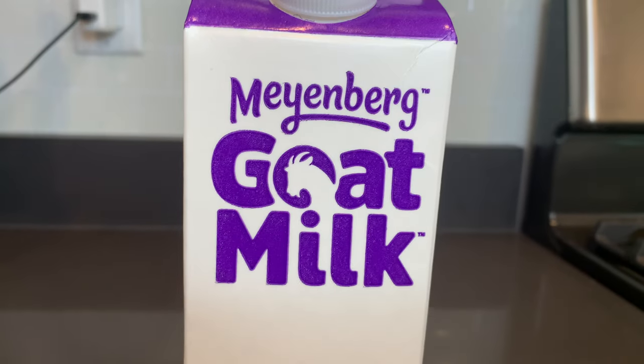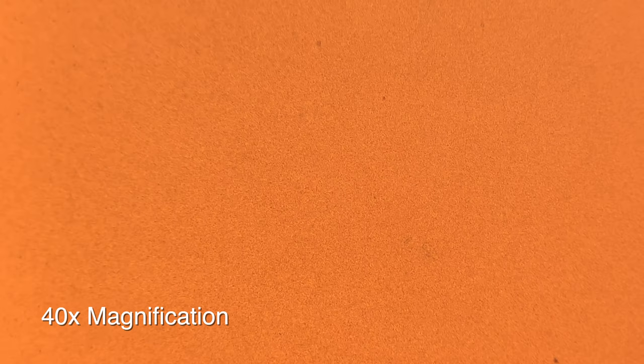The first thing that caught my eye is that it had a reddish hue to it when placed under the microscope. I'm not sure exactly why that is. I thought I'd maybe see something different when I zoomed in, but it looked pretty similar to the whole milk and the 2%.